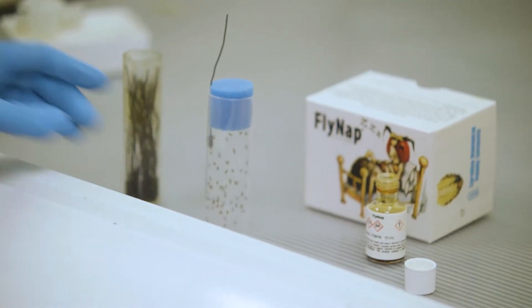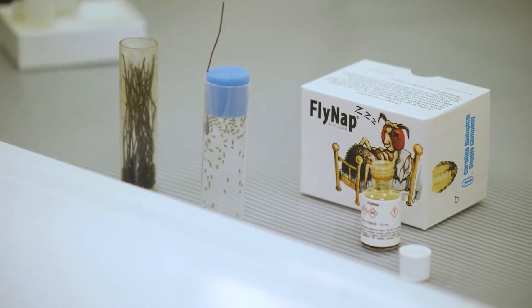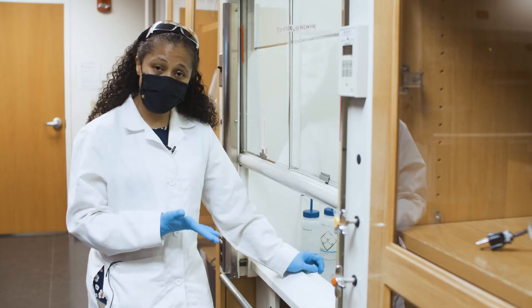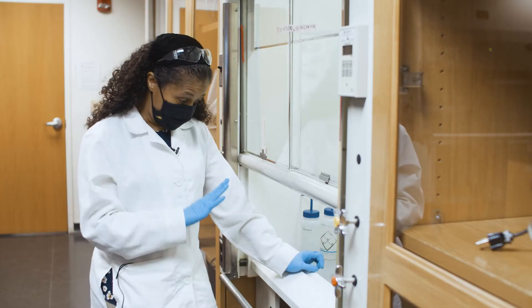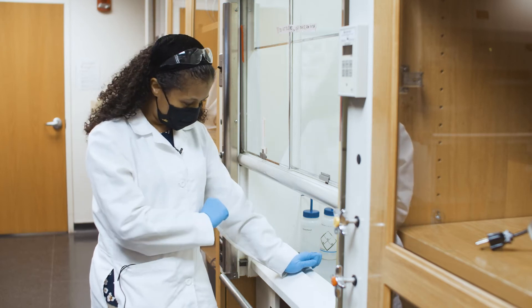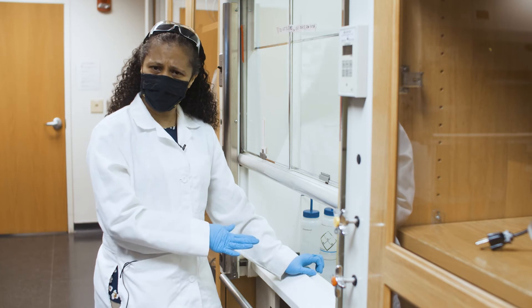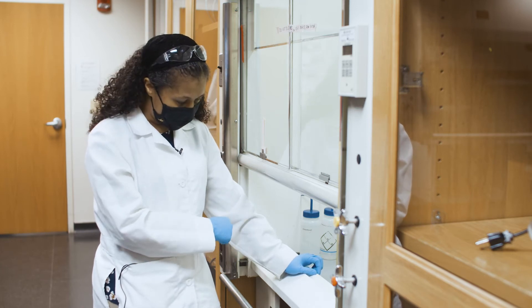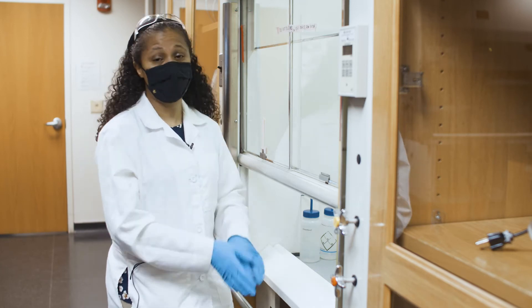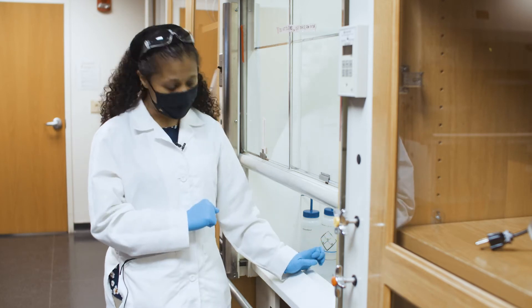Our flies are now being dosed and it usually doesn't take a ton of time for this stuff to kick in. You want to keep an eye out for when they stop moving. As soon as they stop moving, take the wand out. It is very easy to overdose the flies with this stuff, so keep a close eye on them and make sure you get the wand out as soon as they stop moving.